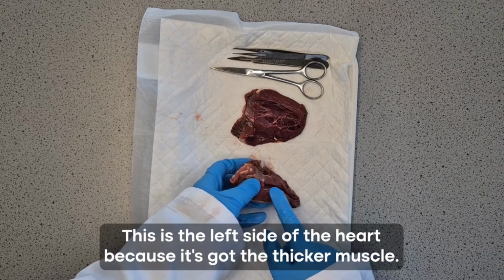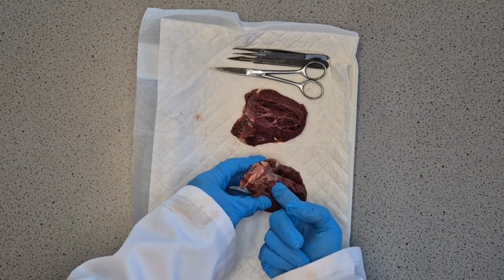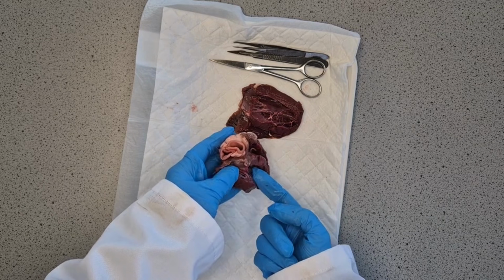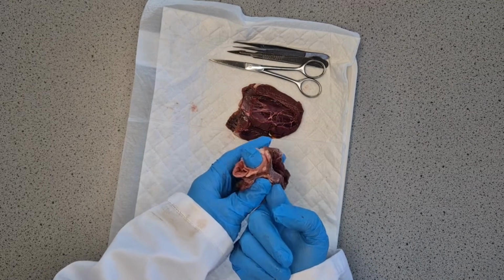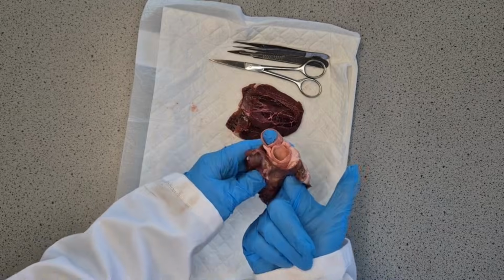We've said that this is the left side of the heart because it's got that thicker muscle. And you can actually put your finger up to go through that blood vessel, and we can see from the left side, the left ventricle is going through this tube, which would be the aorta. From the right side, your finger goes up through that one, which would be the pulmonary artery.